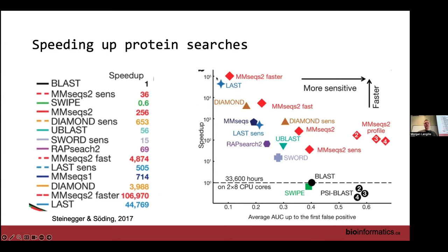It's from Katie Pollard's group. But the idea, if I can describe this, is imagine you have a sample where most of the microbes have a fairly large genome. So the average genome size is quite large, especially if you're thinking about environmental samples. And then your other samples are from a different type of environment, with smaller genome sizes on average.